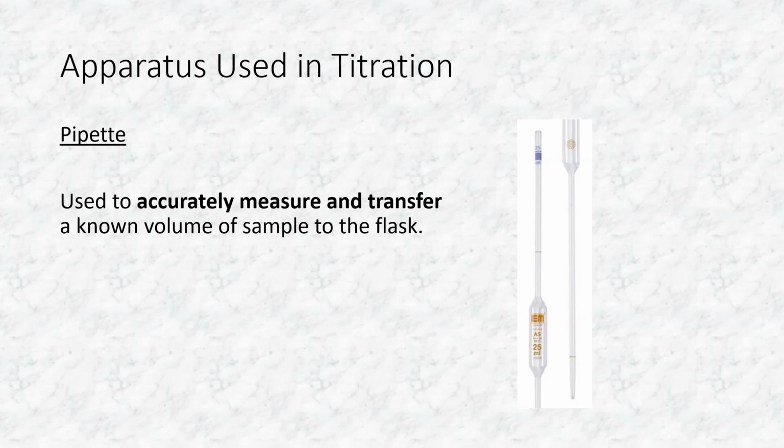That's the end of the pipette that we attach the filler to make the withdrawal of the sample from the volumetric flask. Between the non-pointed end and the bulb, there is a line marked around the pipette, and that is the fill mark. That's the point that you must fill the pipette to exactly in order to withdraw the volume that the pipette is intended to withdraw.